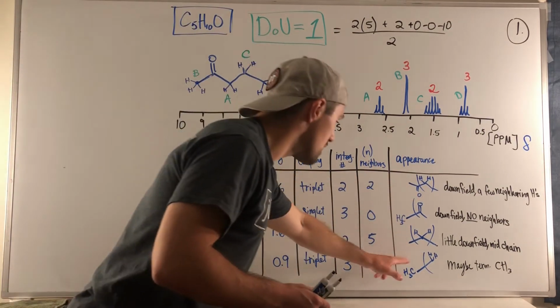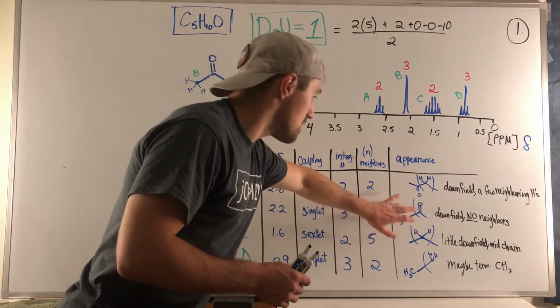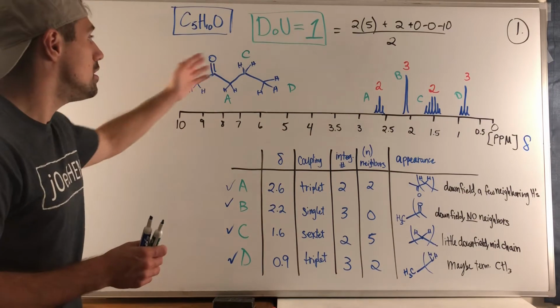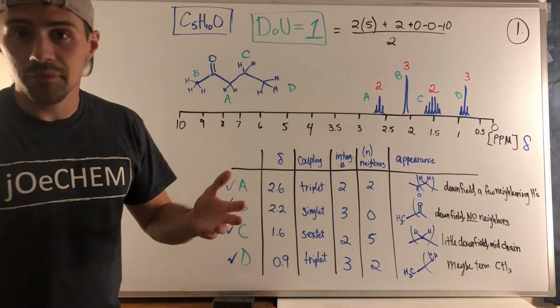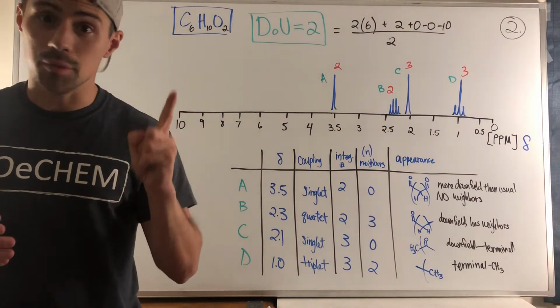This was an end. This was an end. So this helped us determine this and this. This helped us determine it was a carbonyl. That was our degree of unsaturation. We had an end here. We really just needed to connect the 2 and then see if they fit in between, okay? All right, on to problem 2. Okay, gang, on to problem 2.